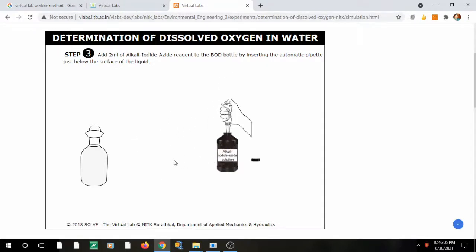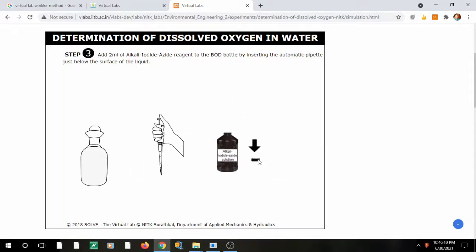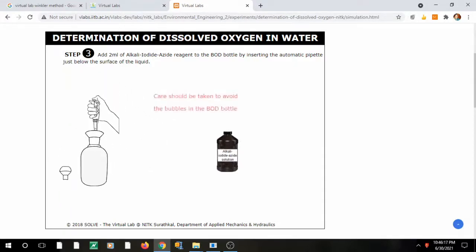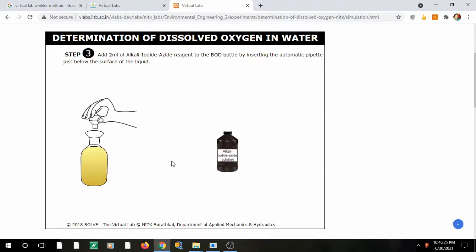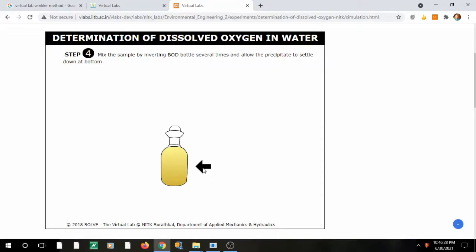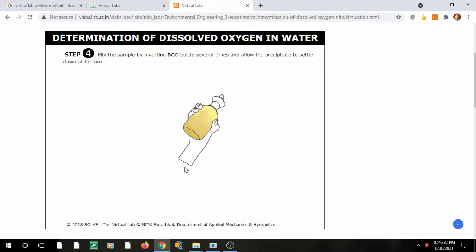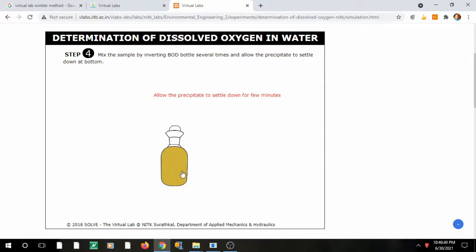Next, add the alkali iodide azide solution. The azide suppresses interference from nitrite or iron if present. Open the lid and add the solution very slowly — there should be no bubble formation, as that would give a wrong reading since you are estimating a gas. Then shake the bottle several times to allow the flocculent precipitate to settle at the bottom, allowing the reaction to take place properly, converting Mn to Mn(OH)₄ flocculent. Allow it to settle for a few minutes.